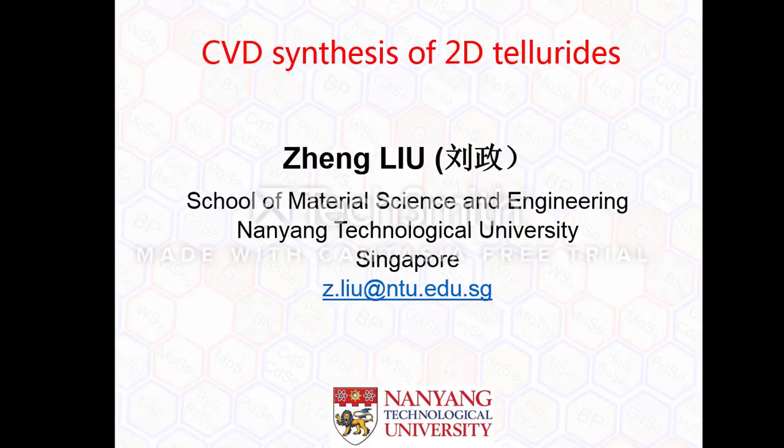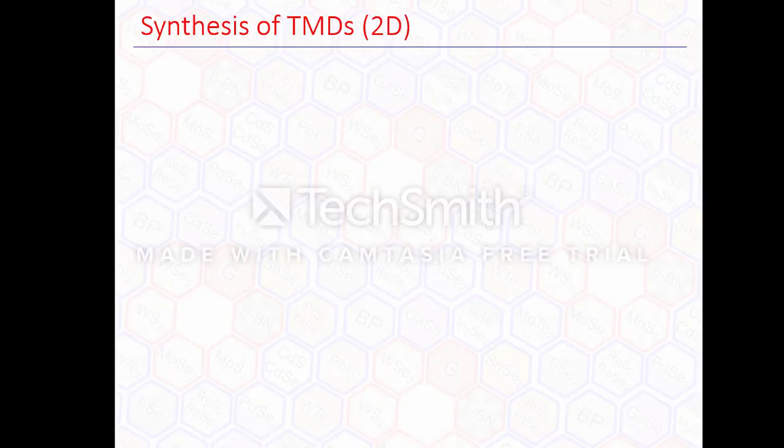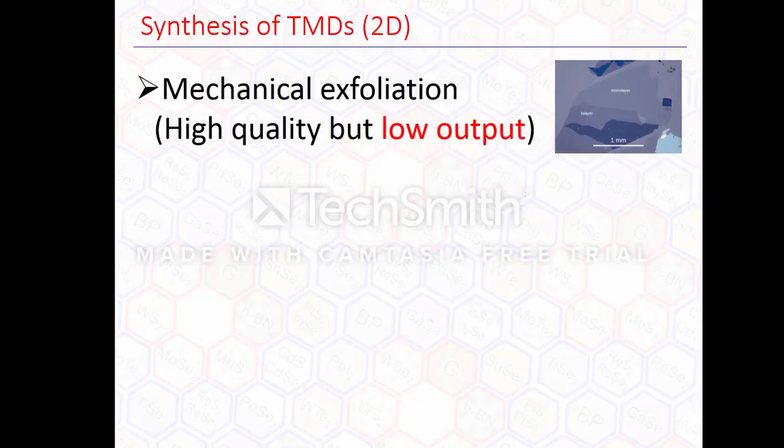All right. So I'm a grower, right? So basically what we're doing, we're growing material. What kind of material are we growing now? We can grow all the family members of the transition metal dichalcogenides using the CVD method. Because the time is limited, I don't show all the families here, but it's more than 40 members now.